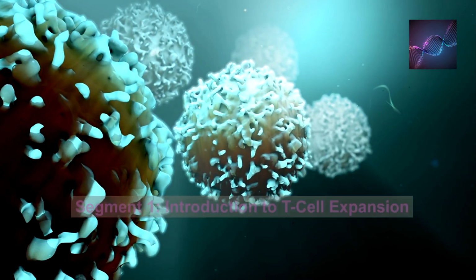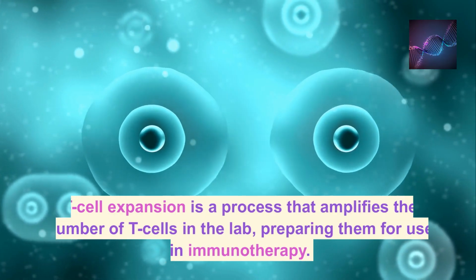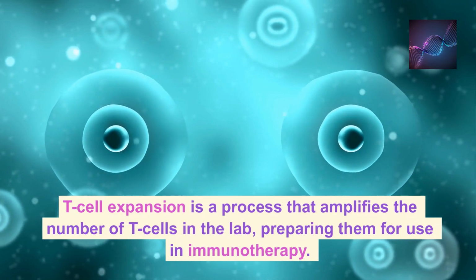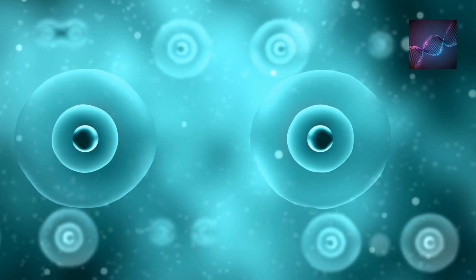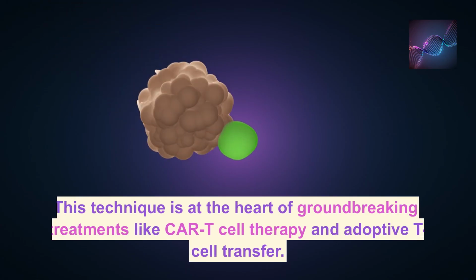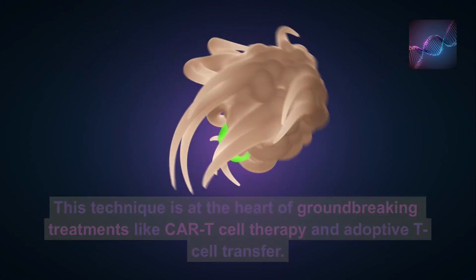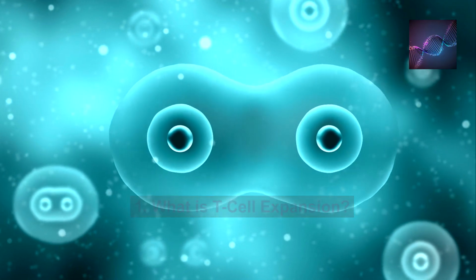Segment 1. Introduction to T-cell expansion. T-cell expansion is a process that amplifies the number of T-cells in the lab, preparing them for use in immunotherapy. This technique is at the heart of groundbreaking treatments like CAR T-cell therapy and adoptive T-cell transfer.